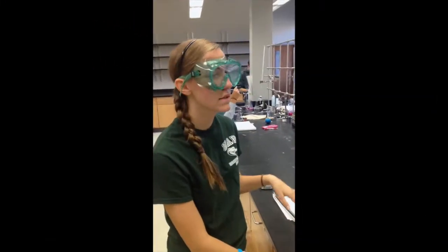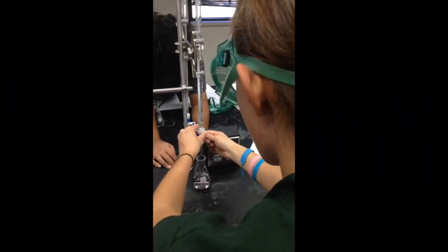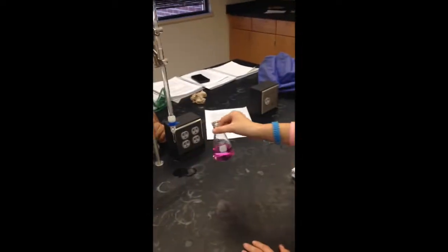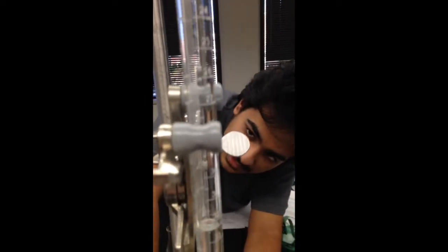So right now we're at 26 milliliters, and the equivalence point is usually around 30, so we're going to let it out slowly until the solution turns light pink. And see, now it's turned pink, so that means we've reached the equivalence point. And what is the measurement? 32.50 milliliters.